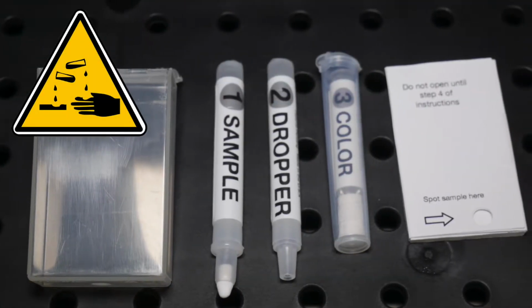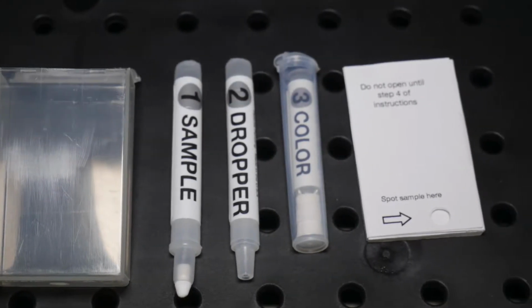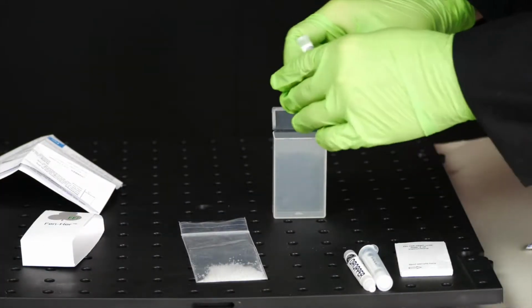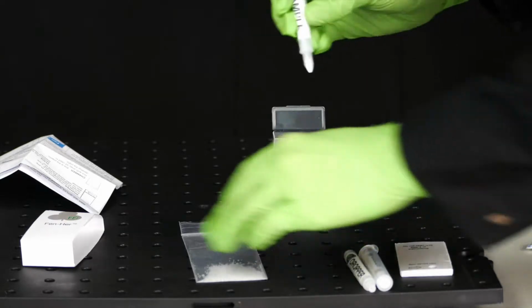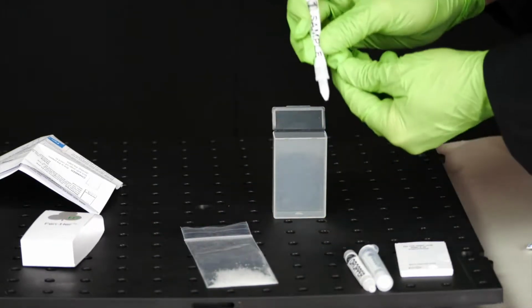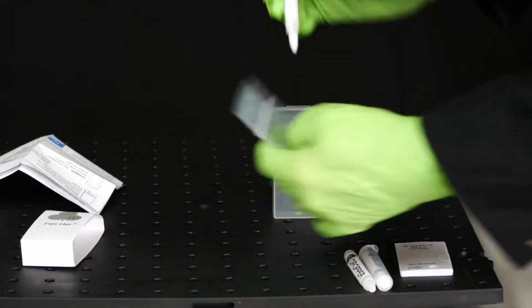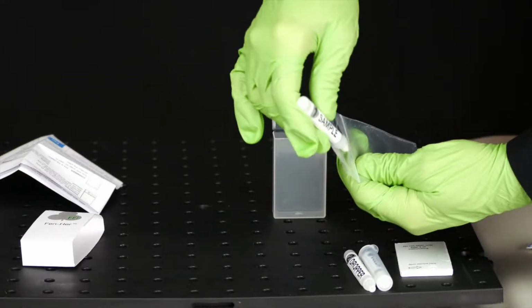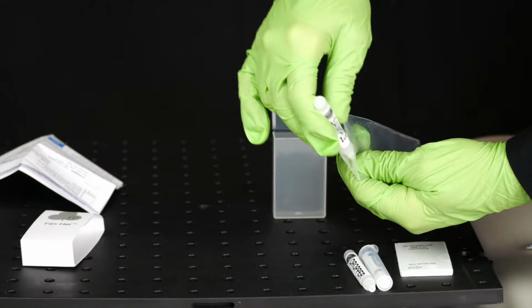Caution: the liquid in the color tube is strongly acidic. With the sample pen tip pointed downward, break the ampule at the letter E. Squeeze tube enough to wet the tip, but not dripping. With the wet tip, rub a very small or trace quantity of the material onto the pen.